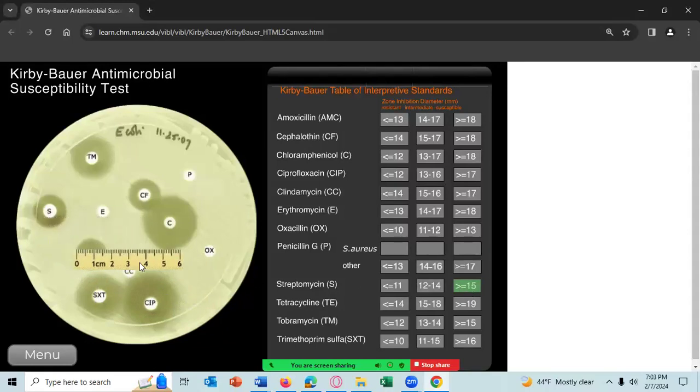For TE, it's probably tetracycline. Yep. So here that looks like about 18 too. I'm going to take the wrong answer and say 19. If you get the wrong answer, it goes in X. Wrong answer, X. So it's actually 18 and it's green.